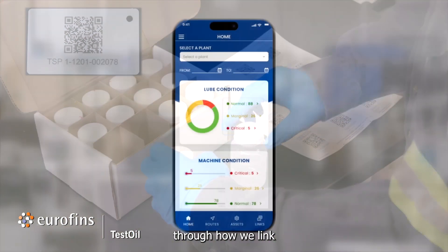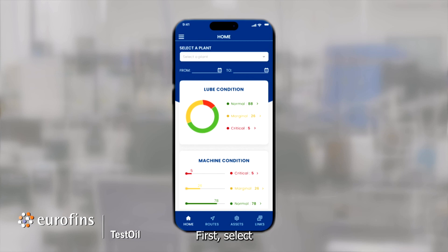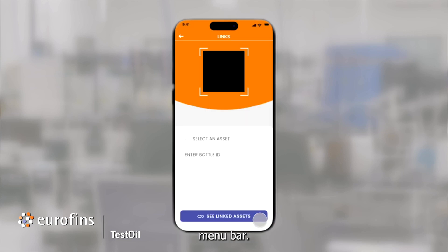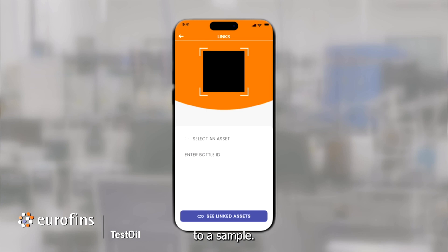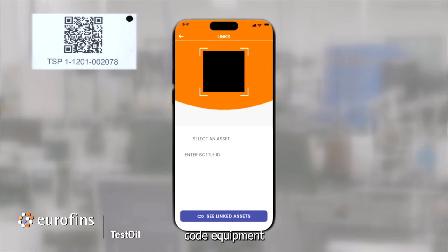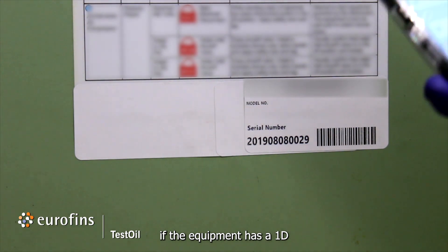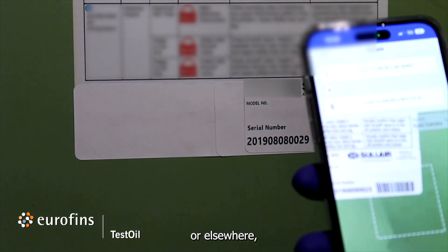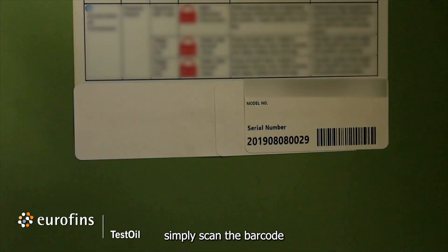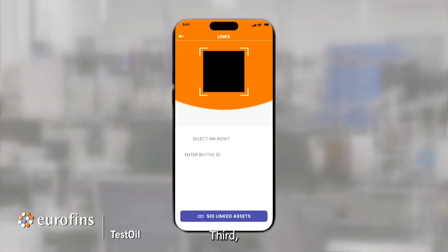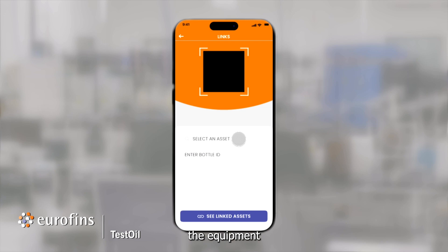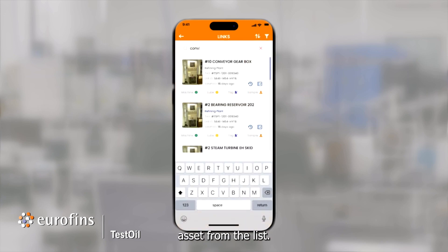Let's walk through how we link equipment information to a sample bottle. First, select Links from the bottom menu bar. From this page, there are four ways to link an equipment asset to a sample. First, if you have a QR code equipment tag supplied by Eurofins TestOil linked to this machine already, simply scan that tag. Second, if the equipment has a 1D barcode on the serial plate or elsewhere, simply scan the barcode to link the machine. Third, if the equipment asset is already uploaded to your data site database, enter the equipment name in this field and select the appropriate asset from the list.